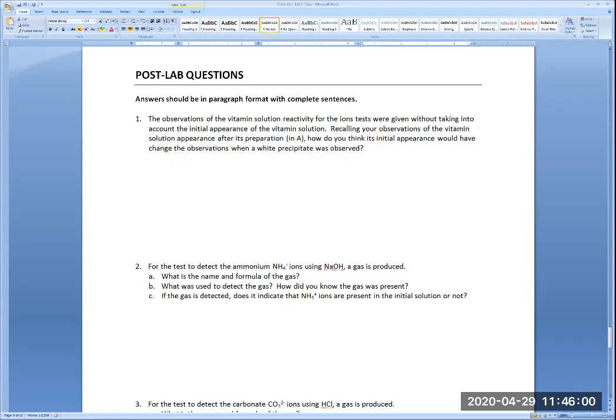And you see, for example, that when you are seeing a precipitation reaction, you see a thick mass obscuring the visibility of your solution. And so all of these describe what happens when you see a precipitate. When you see a precipitate, it will make the solution cloudy. The powder forming in there will make the solution opaque, and it will completely obscure the visibility. So that describes what a precipitation reaction is.